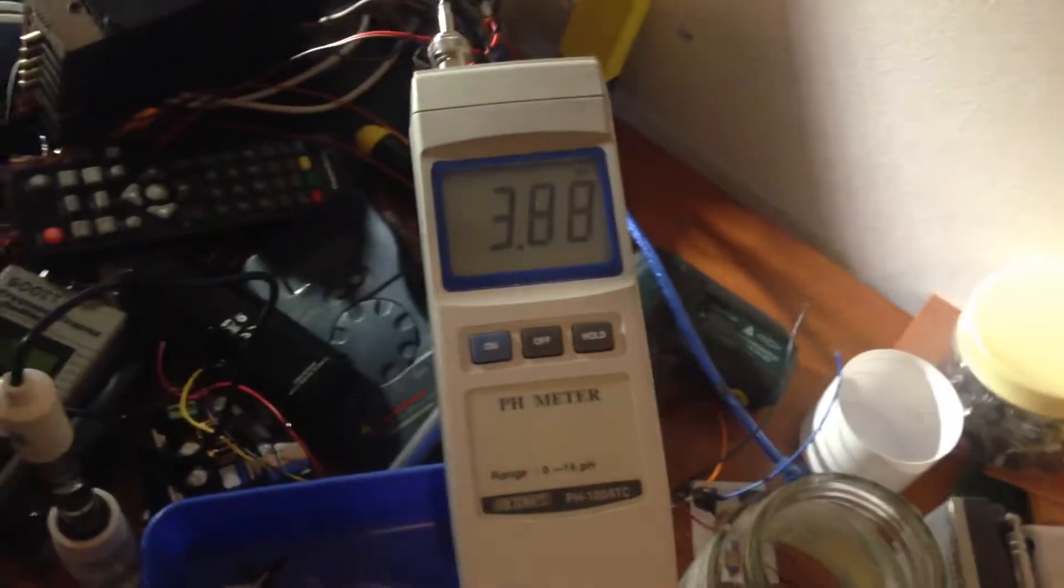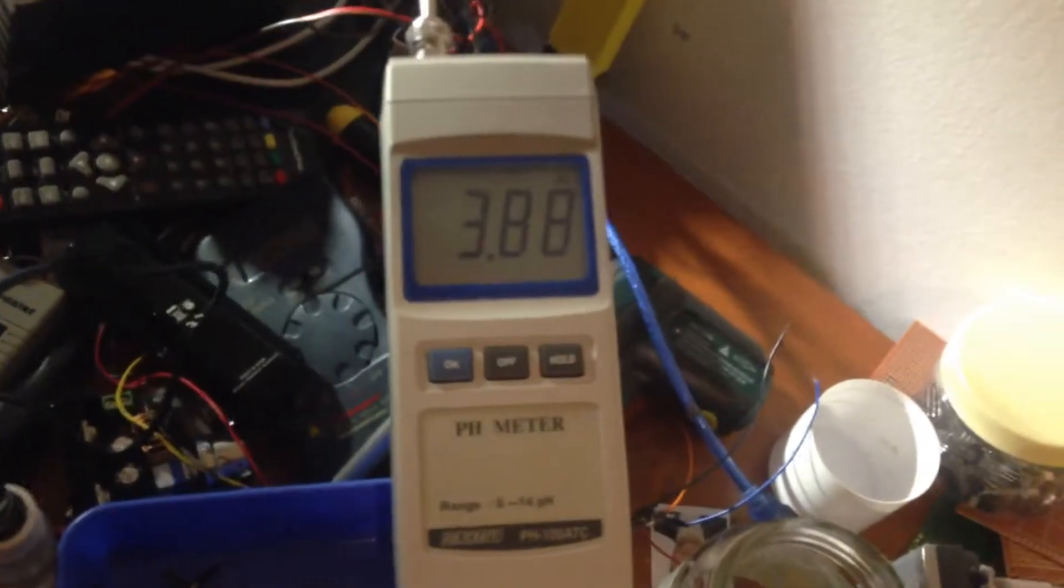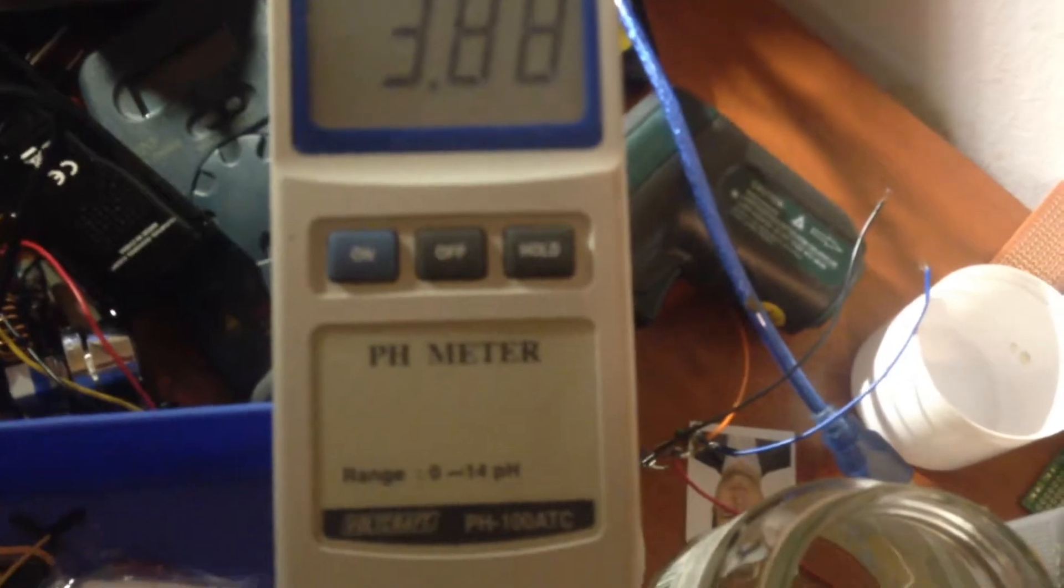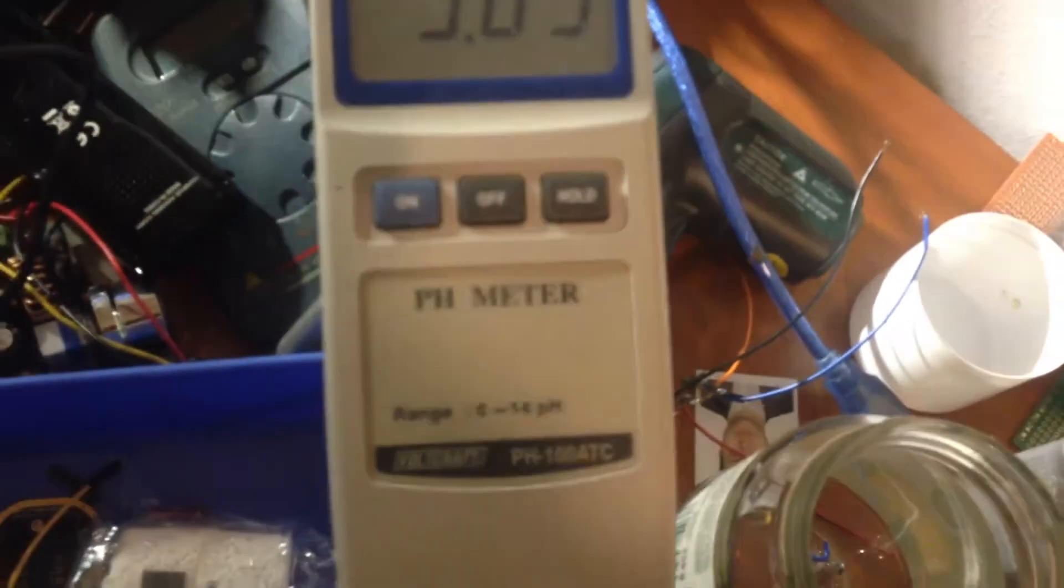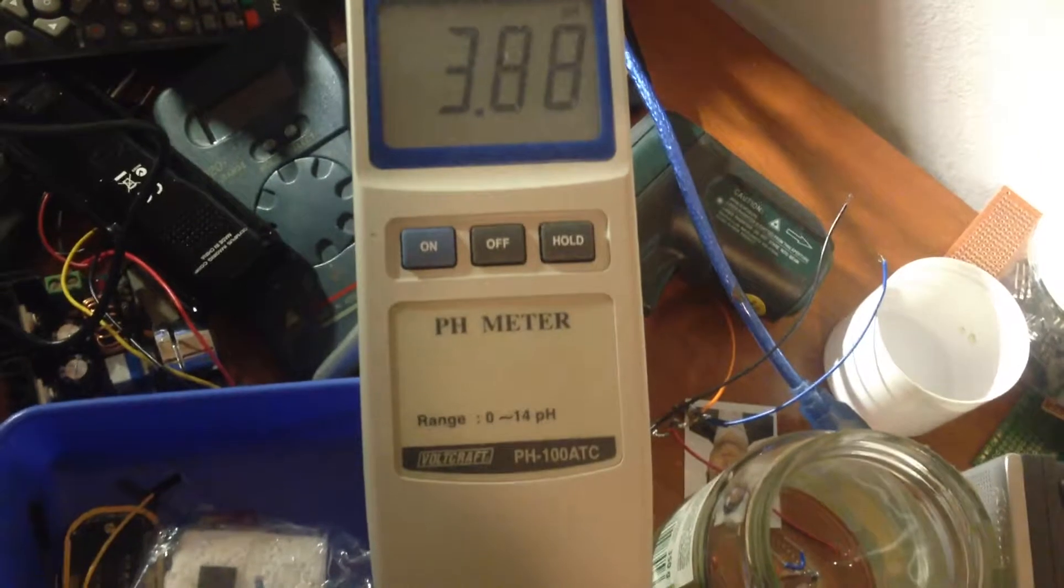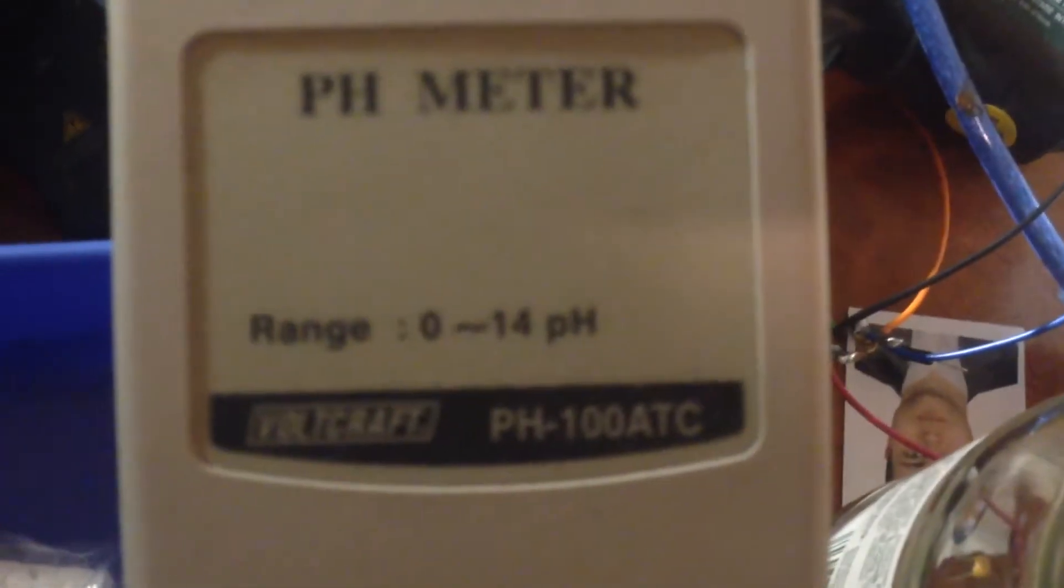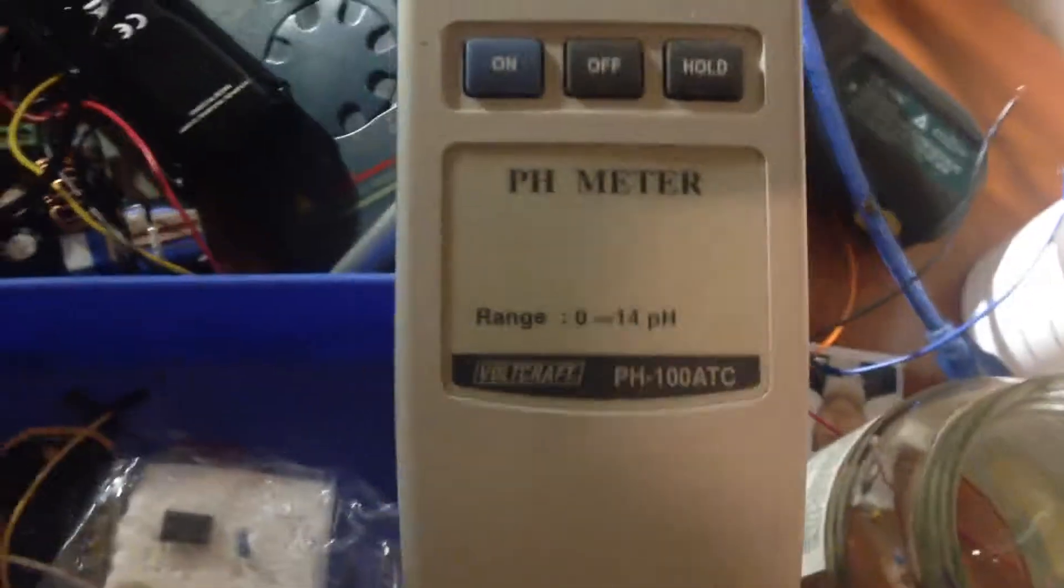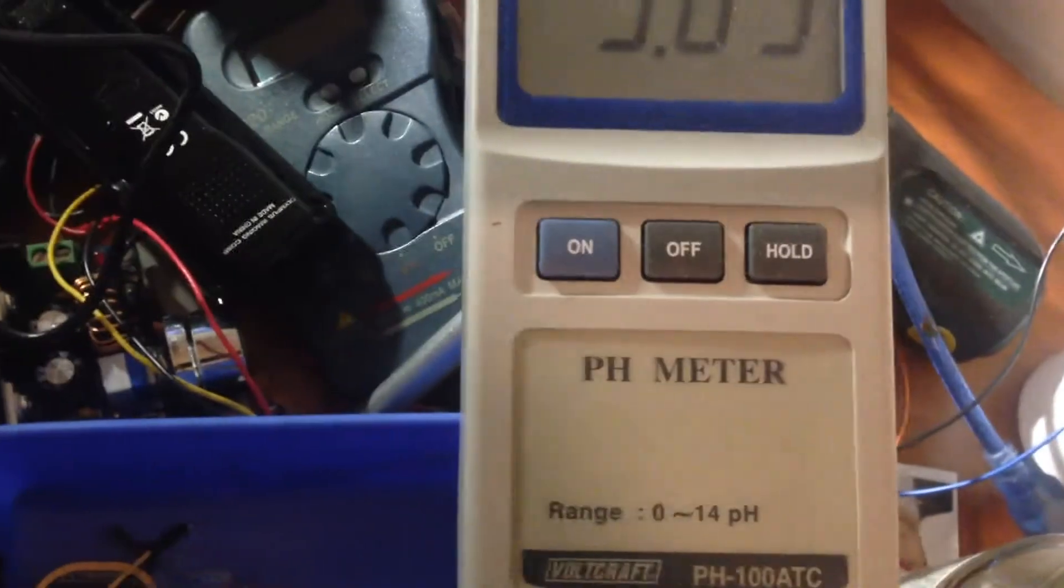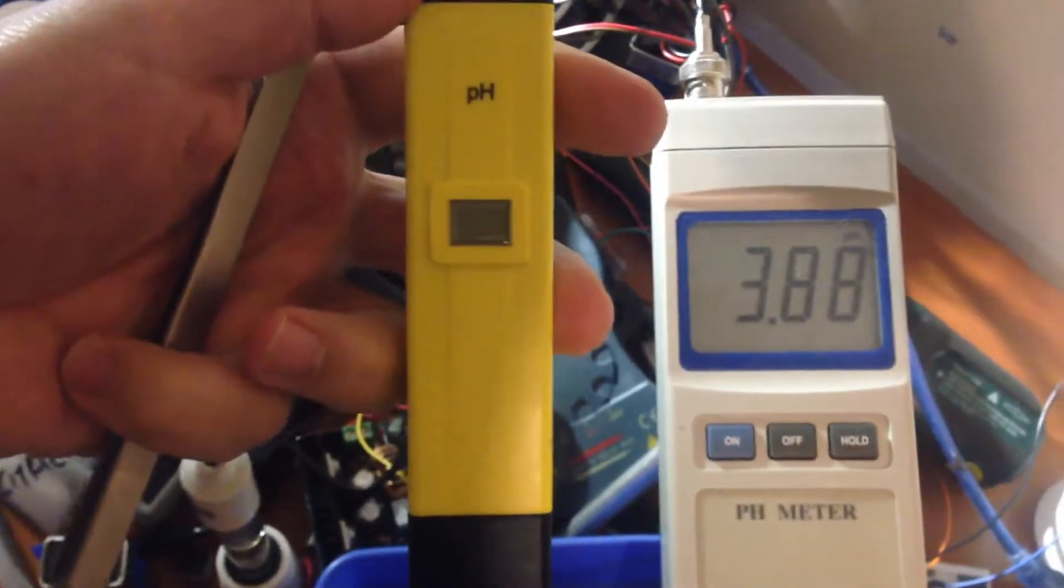Hello guys and hope you're doing good. Today I'm trying out one pH meter from the Voltcraft company. This is from the Voltcraft company and also I ordered one pH meter with no name from eBay.